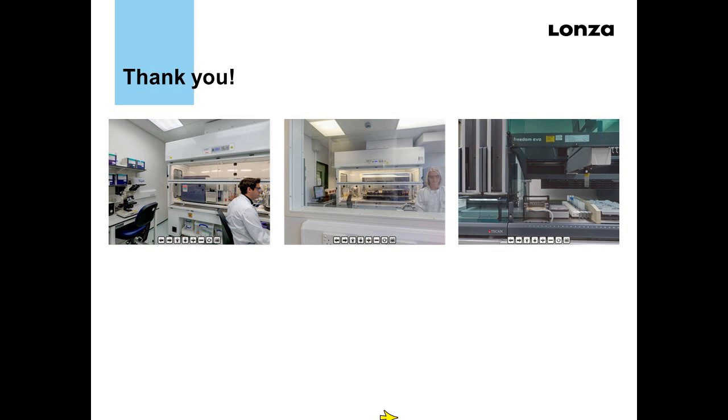So you've got a massive time saving there using the automated method, which has also got efficiencies for the 2AB labeling as opposed to the traditional version of 2AB labeling. We're also using a much faster gradient for each sample.